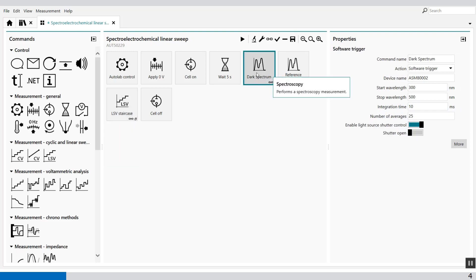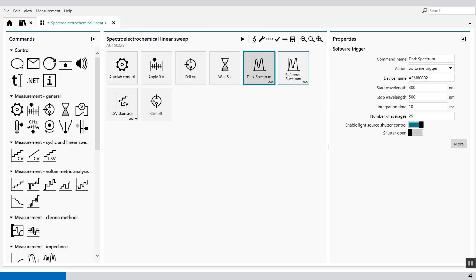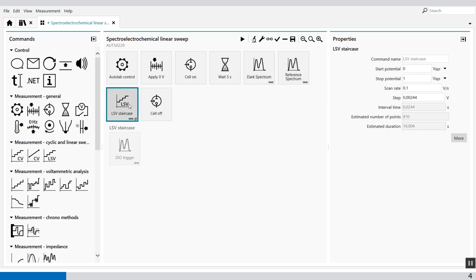So this procedure is set up that we take first the dark spectrum then the reference spectrum. Then we do a linear sweep voltage from 0 volt to 1 volt. With a scan rate of 100 millivolt per second and a step potential of 0.002 volts.